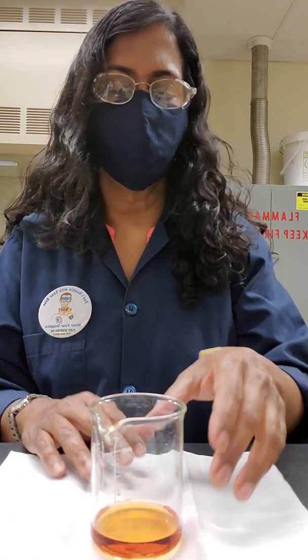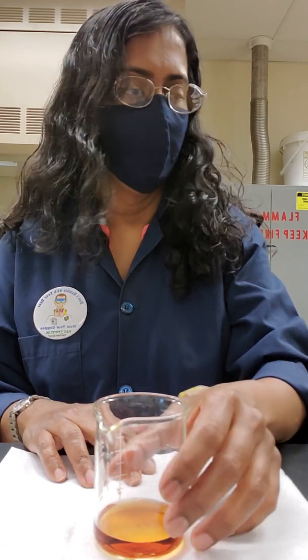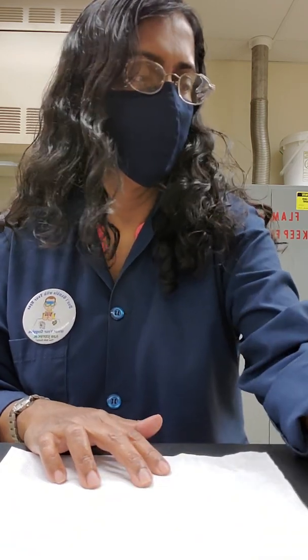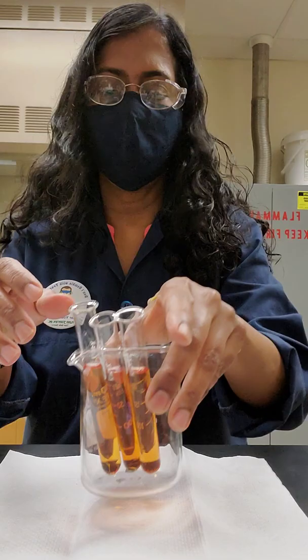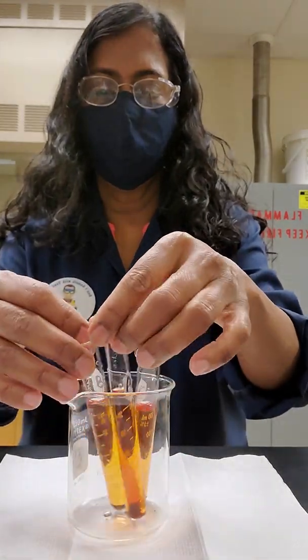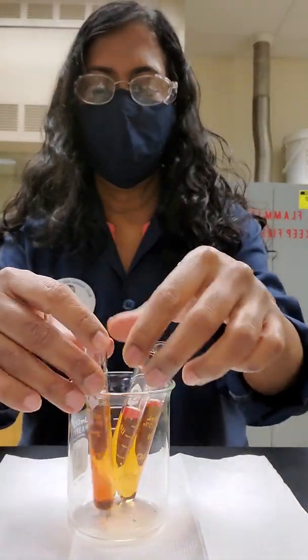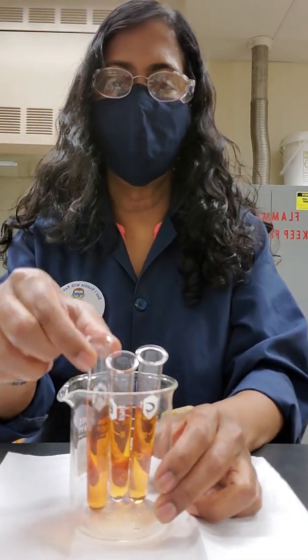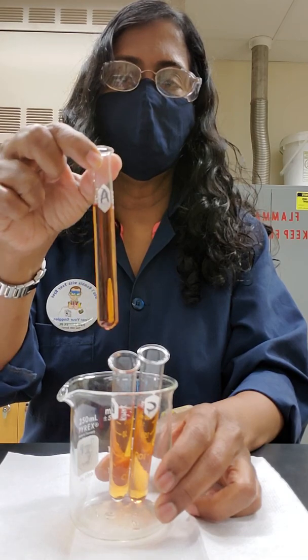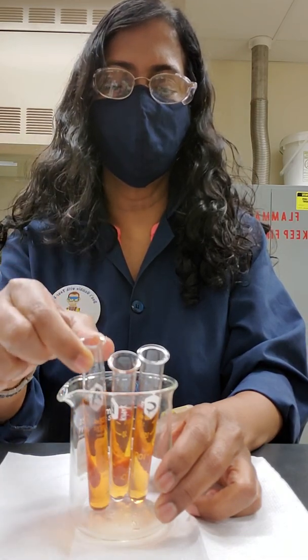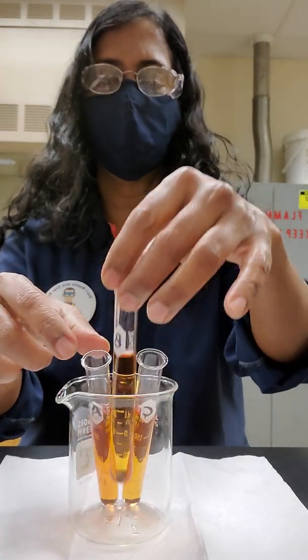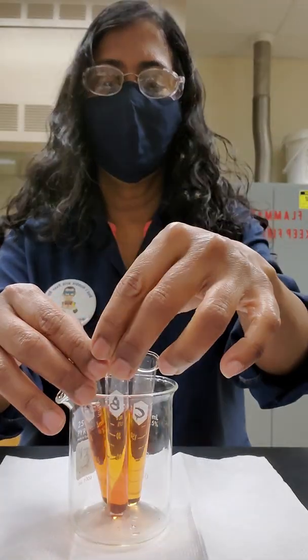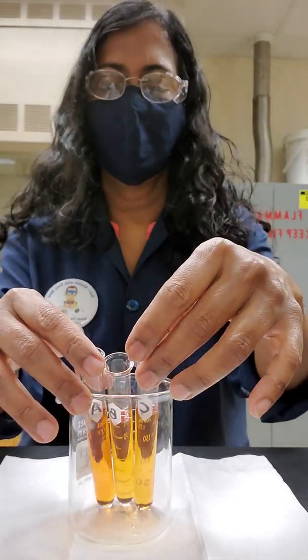Out of this solution, I added 10 milliliters into three test tubes. I have my three test tubes here labeled A, B, and C. Test tube A will act as our control experiment, and we are going to work with test tubes B and C.